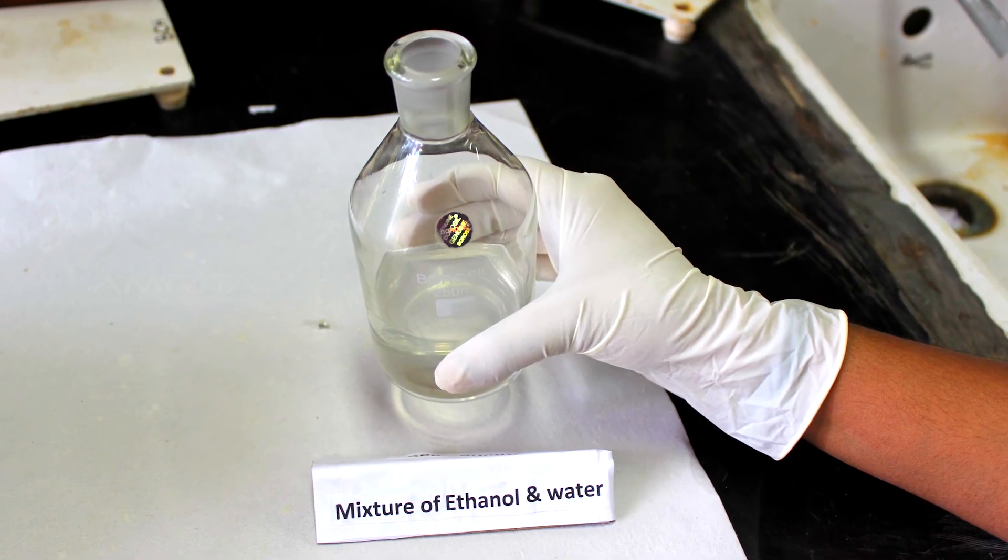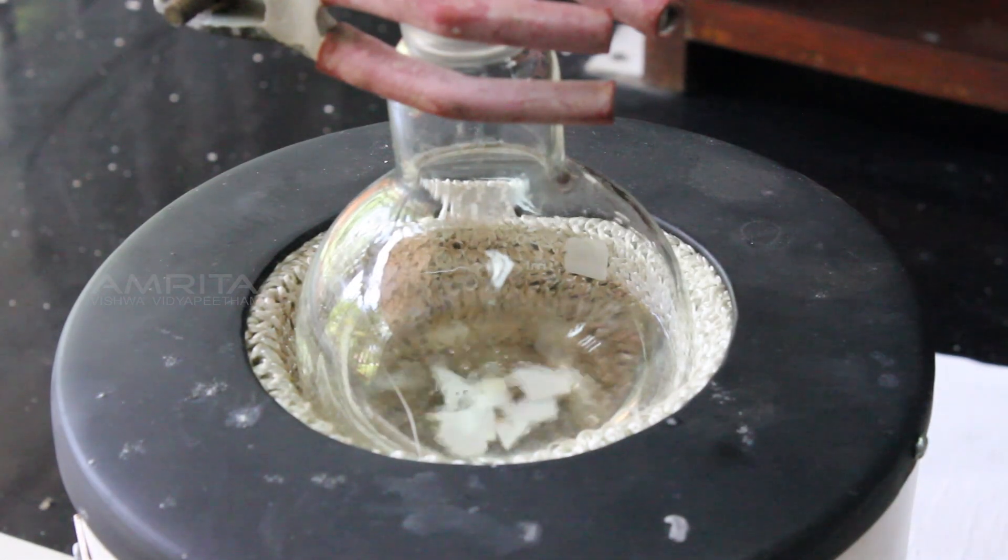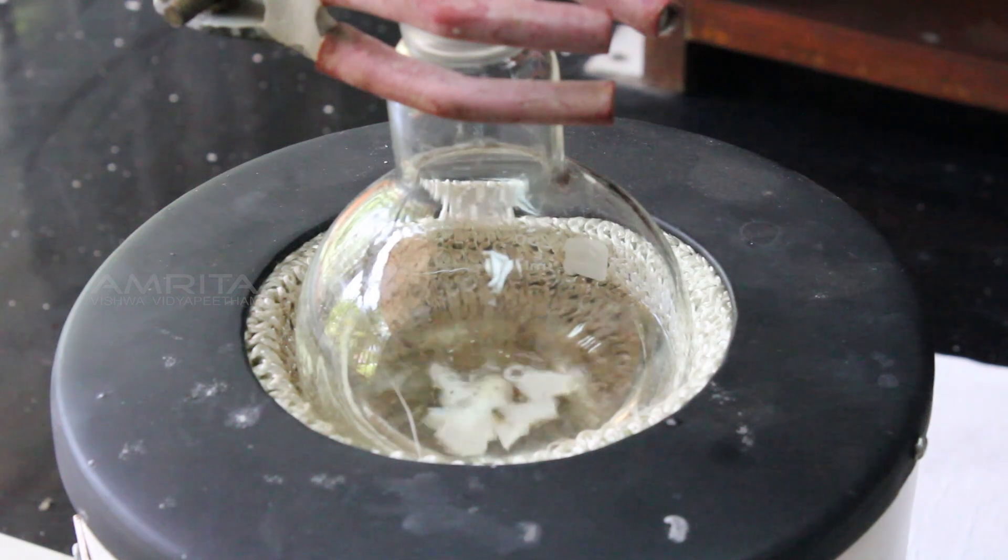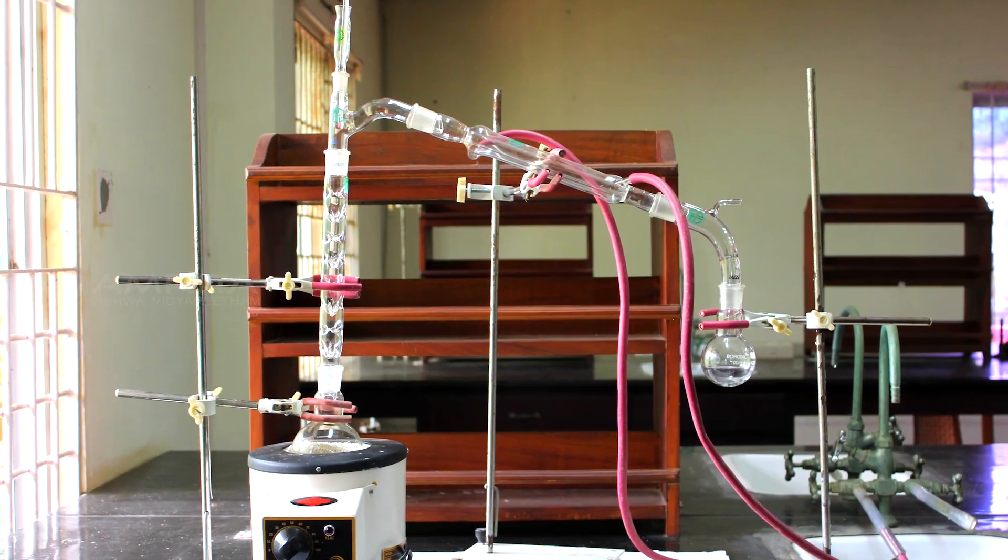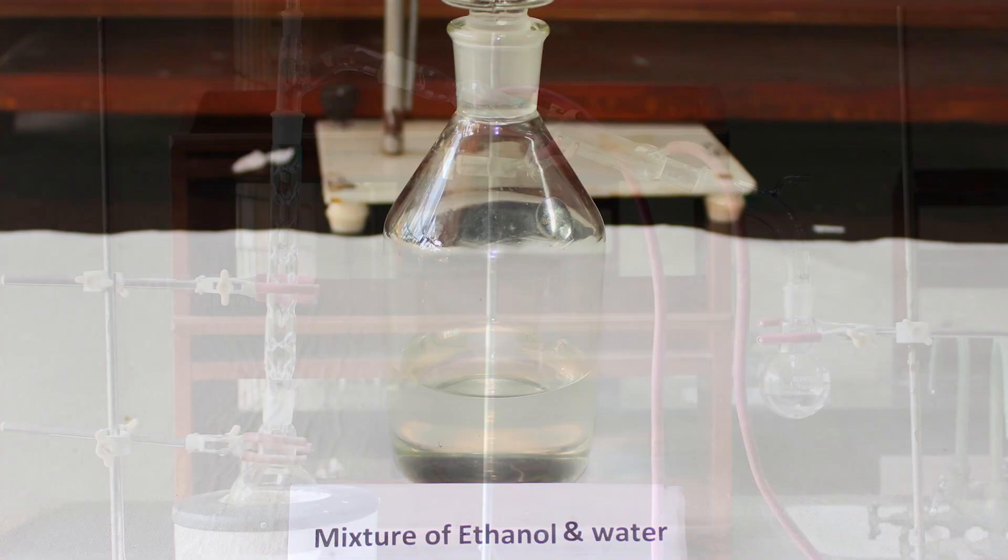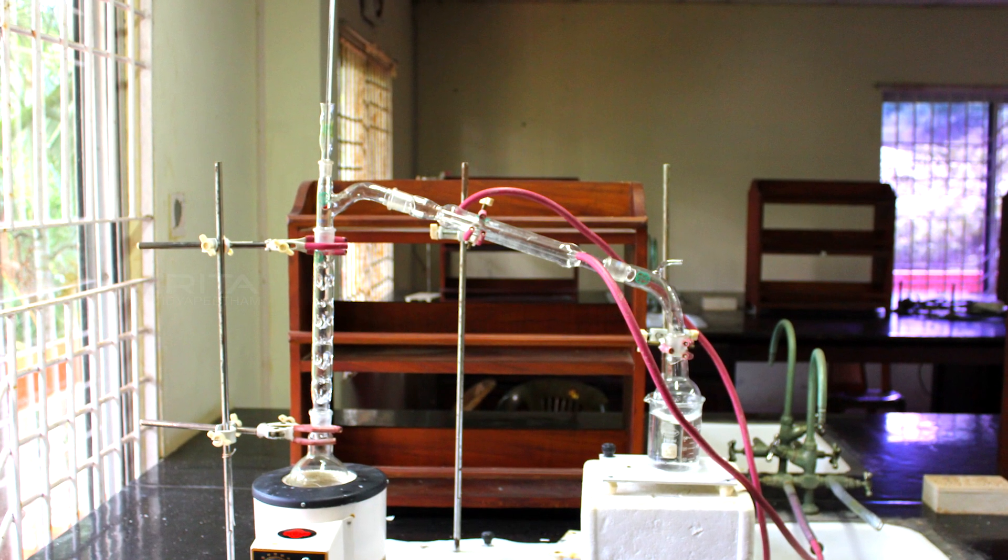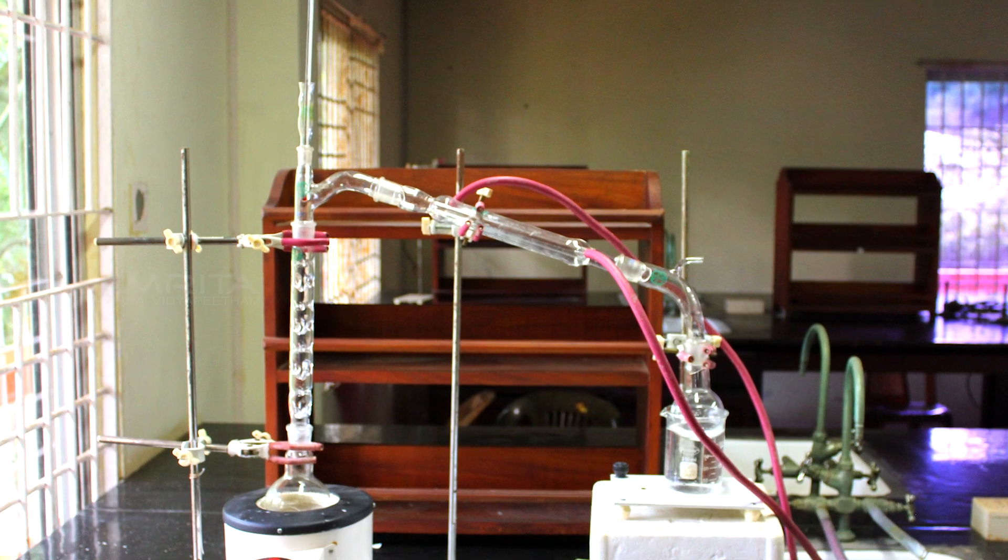Therefore, the separation of two or more miscible liquids for which the difference in boiling point is less than 25K can be done only by fractional distillation. Since ethanol in water forms an azeotrope, the distillation has to be repeated to obtain the pure components.